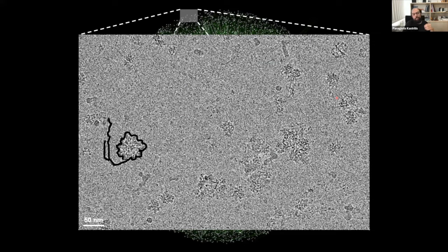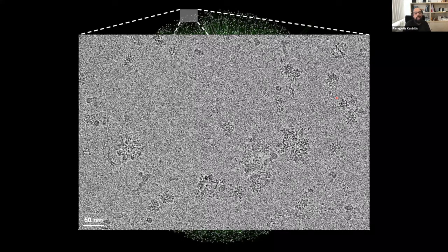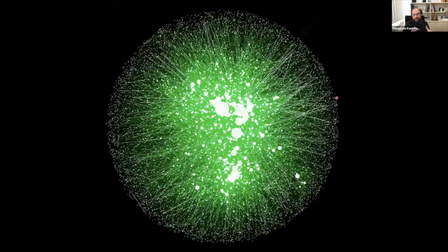And by acquiring more and more data, more and more images of cell extracts, you can see these interactions, higher order assemblies present there, and try to average and increase the resolution in order to understand how they are structurally at higher and higher resolutions. And hopefully we can map all of these interactions and add the experimental dimension to the interactors.